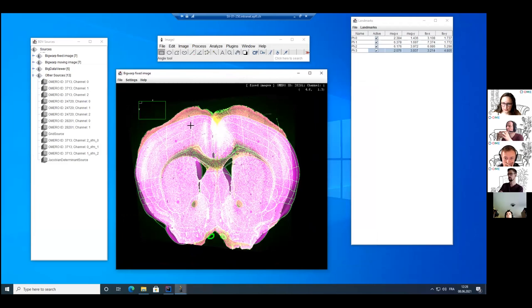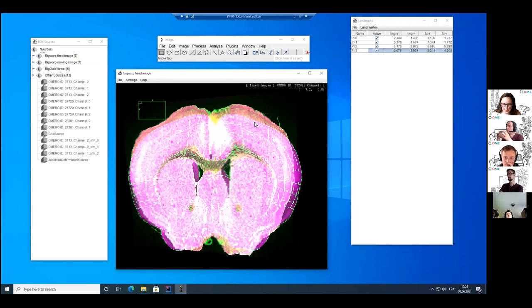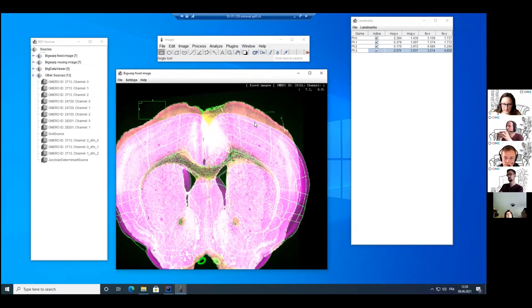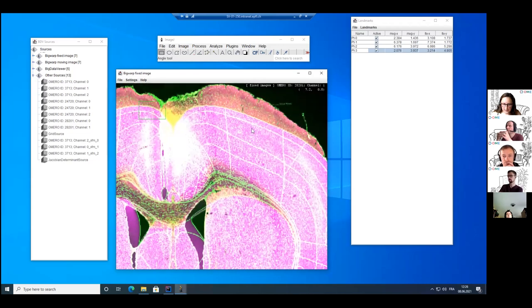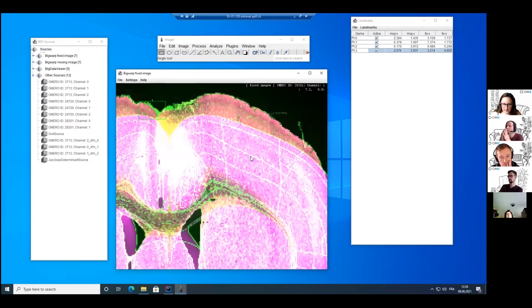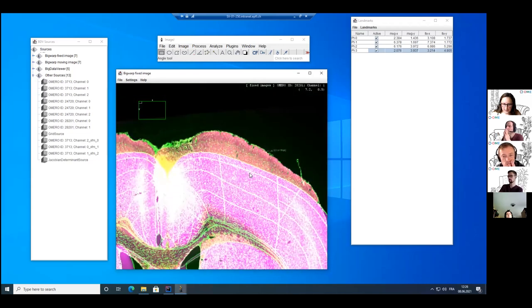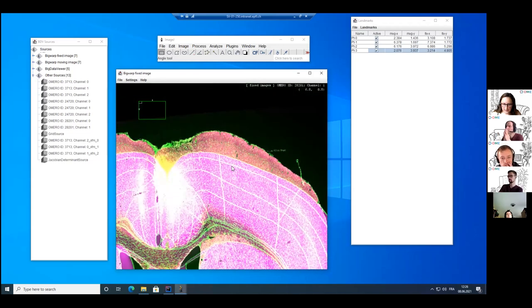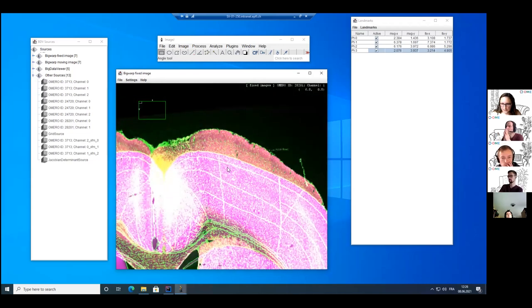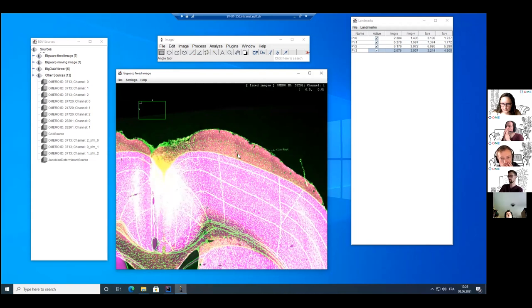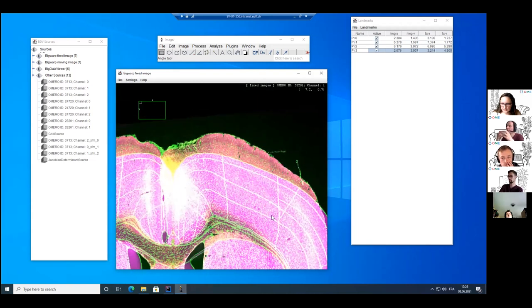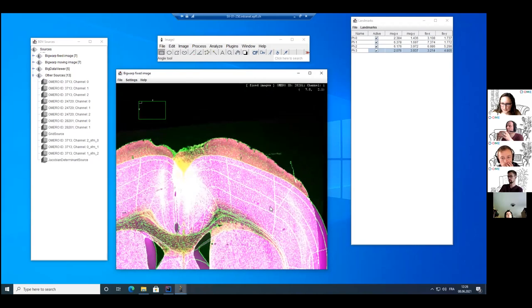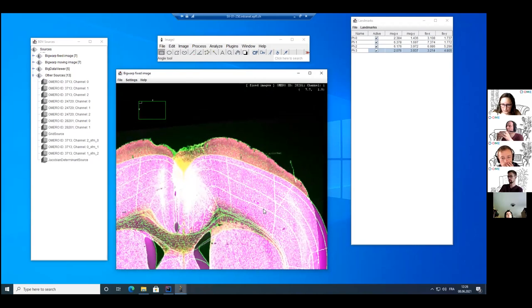So if I quit the landmark mode, I can scroll and here we can see again the lazy loading of the different multi-resolution levels, but I can also adjust and fine tune my mapping.